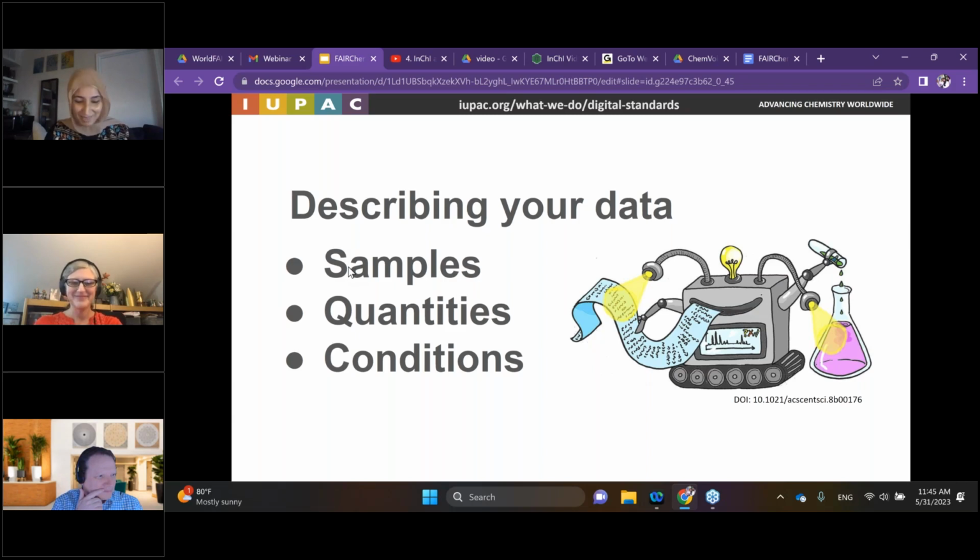So capturing chemical measurement is dependent on sample, but sample is a complex issue when we talk about data. Sample's origin is wide and varied. It could be a product of a synthesis reaction, or the output of a batch process, or collected from a natural environment like soil, water, rocks, etc. Many pieces of information are attached to each sample, like the type, the quantity, the location, the time, the physical state. Is it a mixture? Is it a solution? Is it pure? The time of measurement, the analyst, the location, and so on and so on.